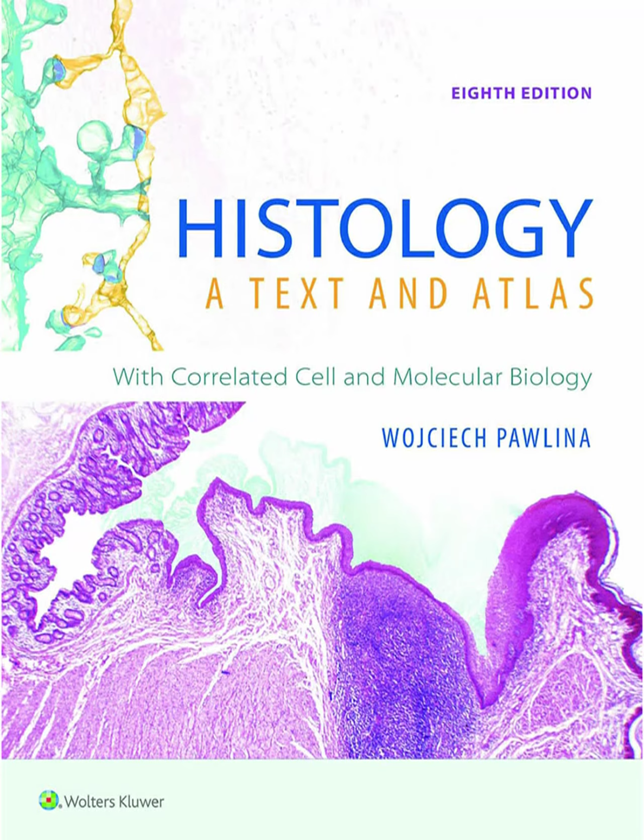Another approach is STED microscopy, which uses a second laser beam shaped like a donut to effectively switch off fluorescence around the central excitation spot, making the spot much smaller than the diffraction limit. The result: resolution down to maybe 10 or 20 nanometers. It allows us to see cellular structures like the detailed organization of synapses or cytoskeletal elements in unprecedented detail, sometimes even in living cells. It's truly revolutionized cell biology.